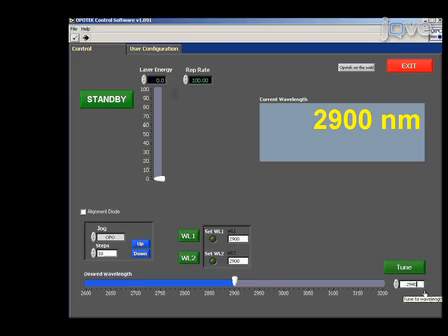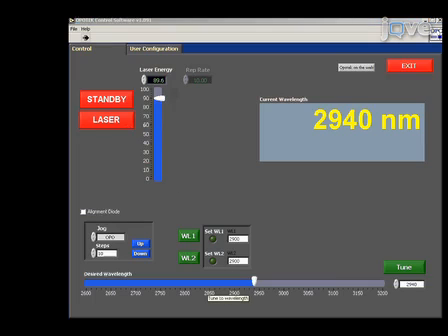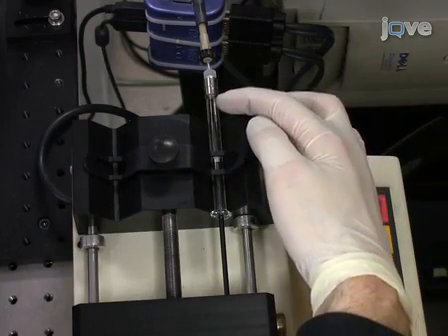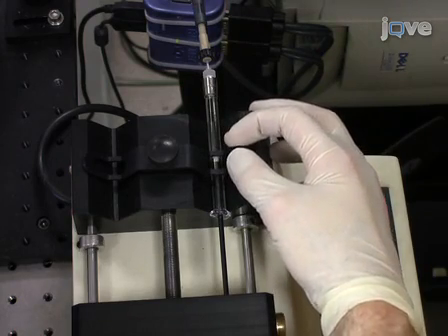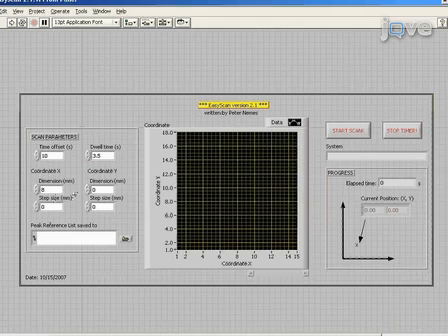Start the mid-infrared laser source at a repetition rate proper to produce sufficient signal-to-noise ratio for selected ions in the mass spectrum within the dwell time at each pixel to perform a LAESI lateral imaging experiment. Turn on the electrospray source. Make sure that there is enough solution for the full time required for imaging. Now, simultaneously start the acquisition of mass spectra, the mid-IR laser ablation, and the surface scanning, and collect data.